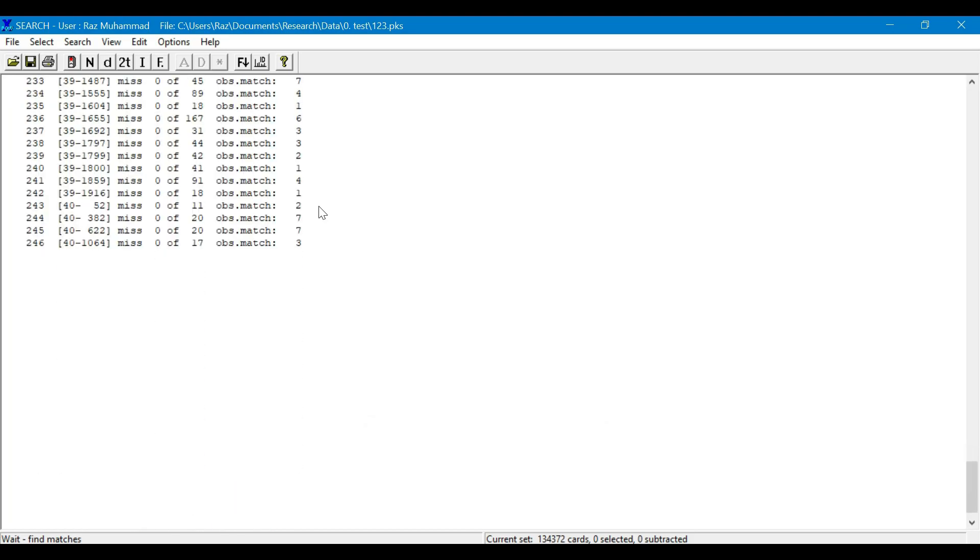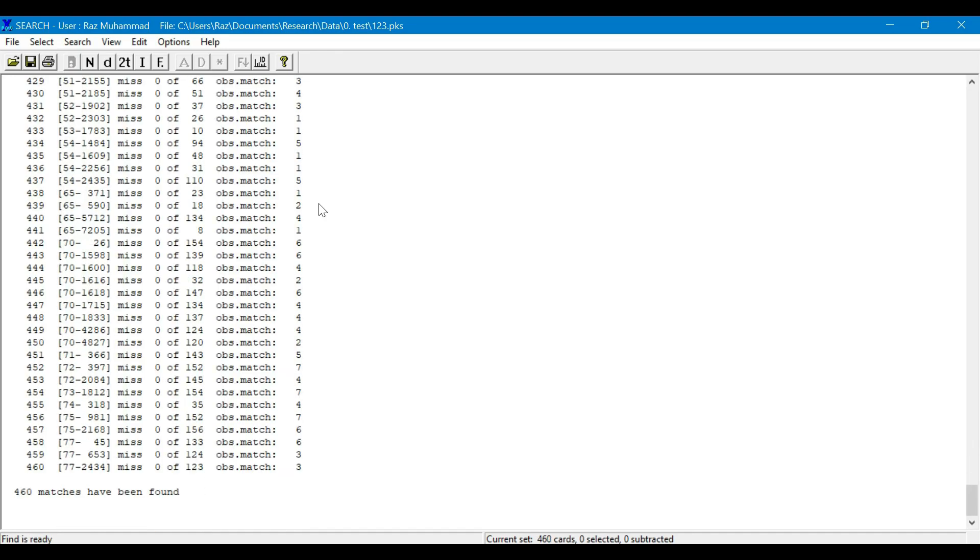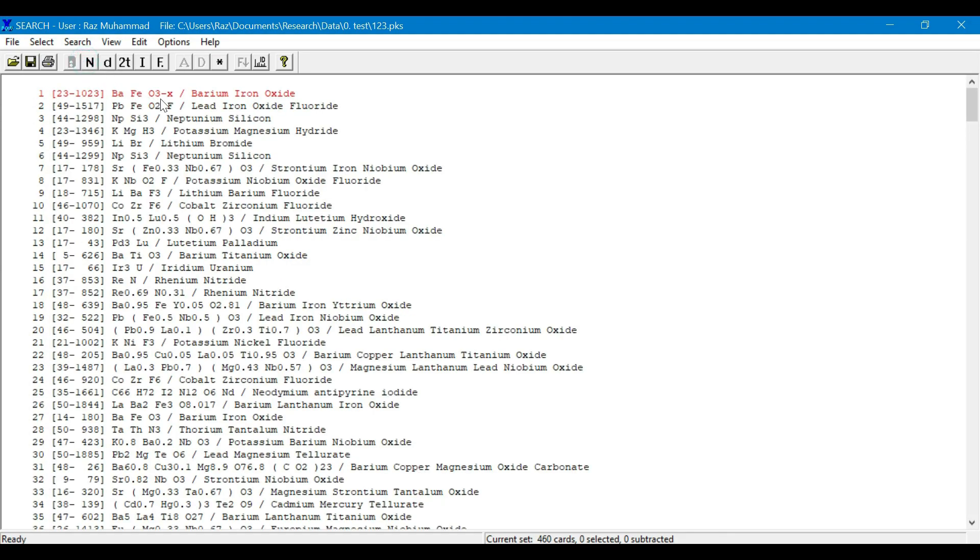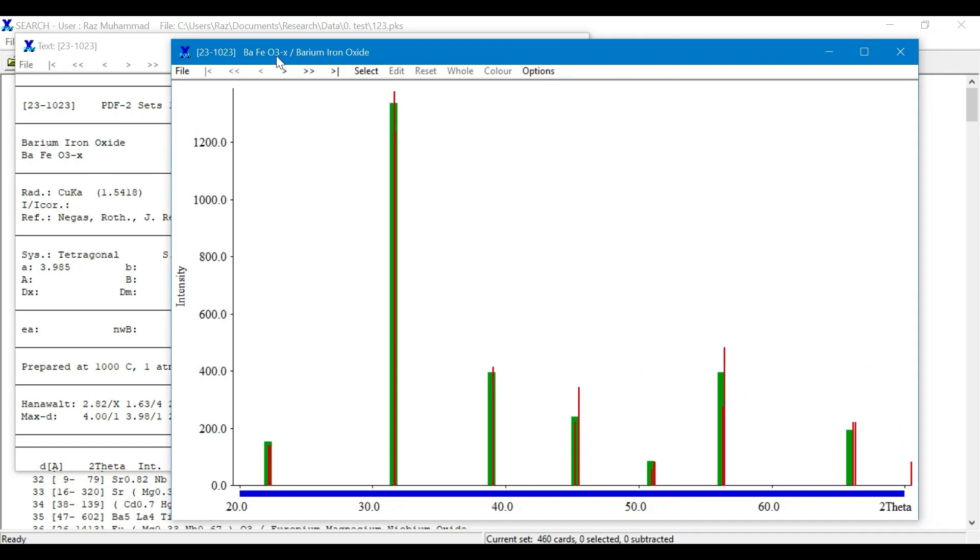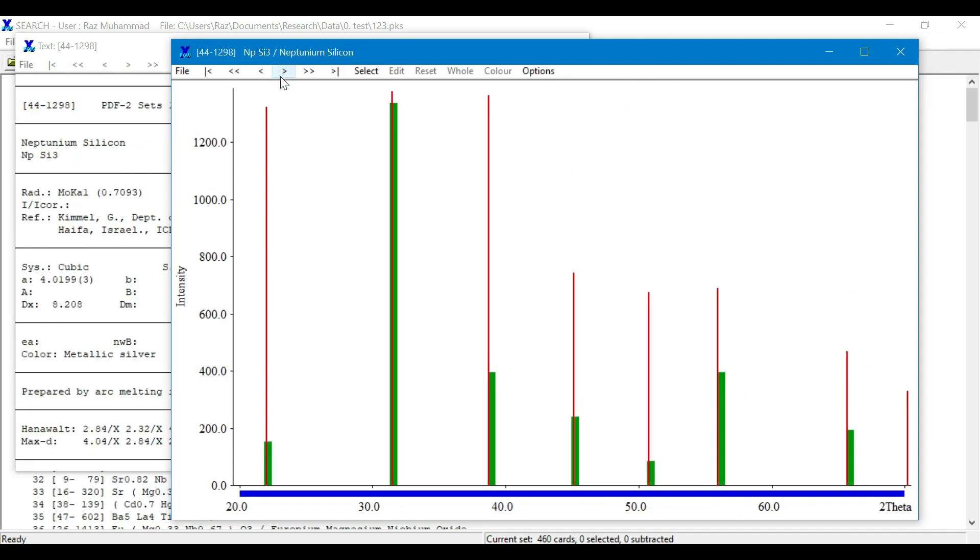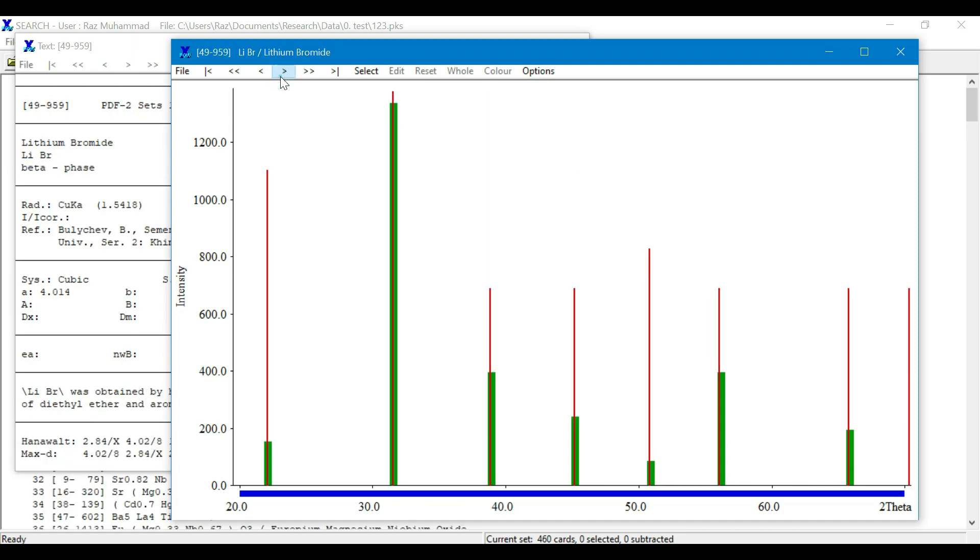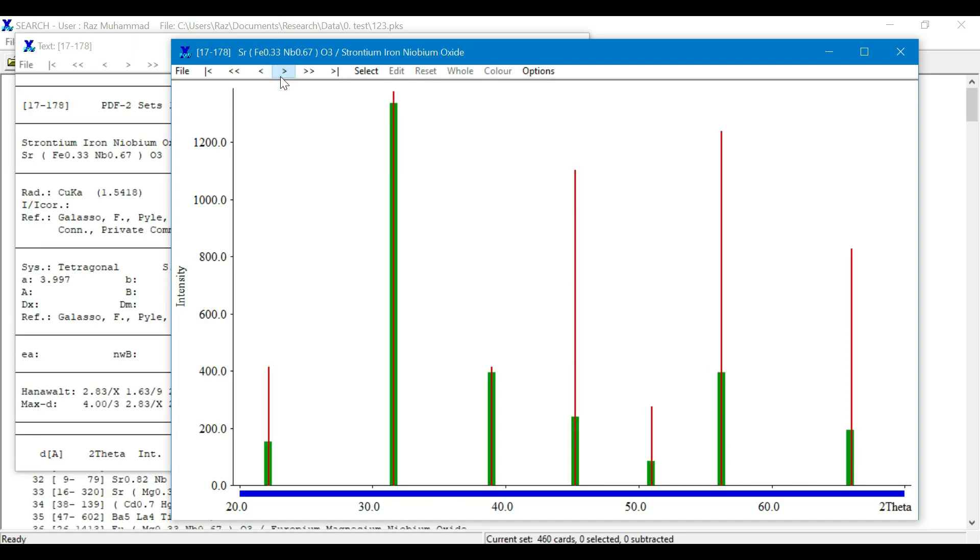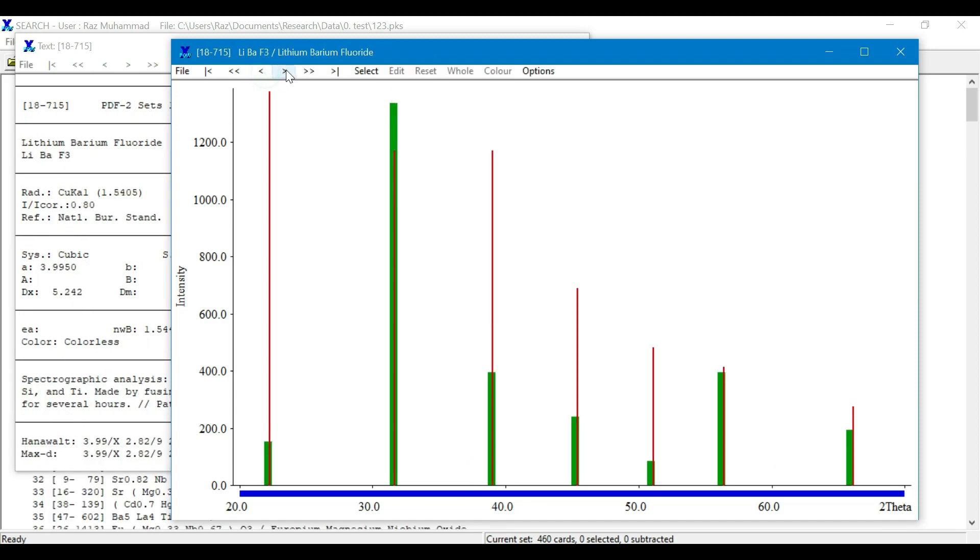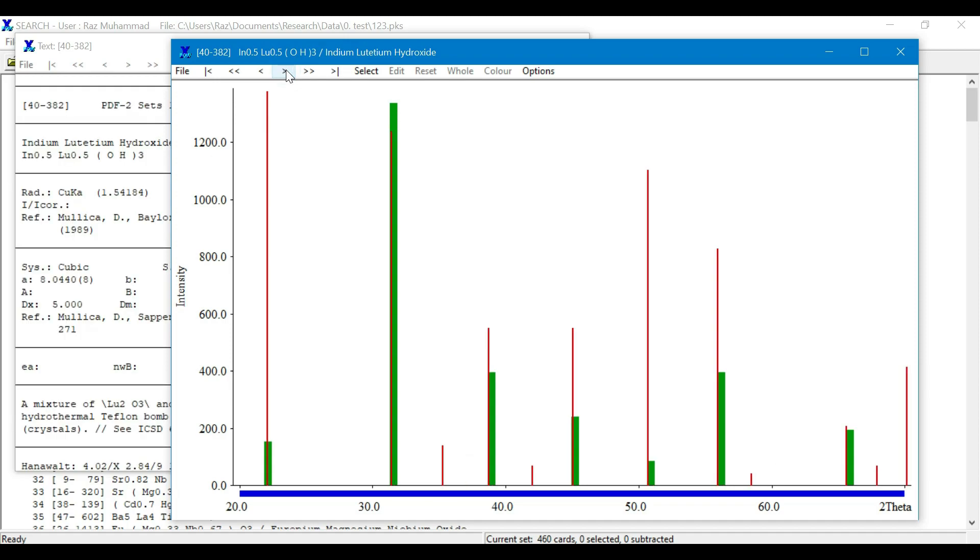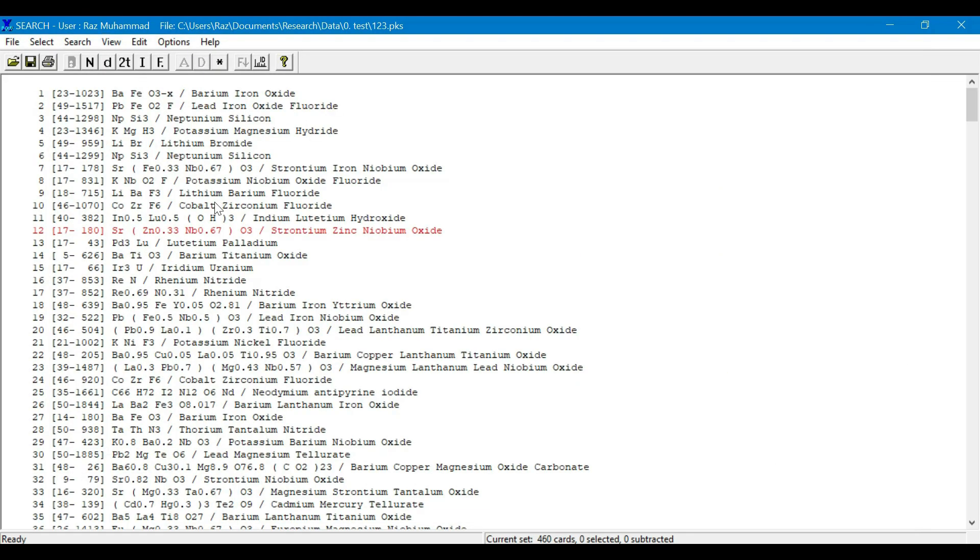After automatic search, we can see a list of different combinations or different cards. For example, the first card is for barium ferrite. If we look into this card, it is well matched with the barium titanate. Actually, barium titanate and barium ferrite have similar crystal structures, that is tetragonal, which is why their diffraction patterns are similar.